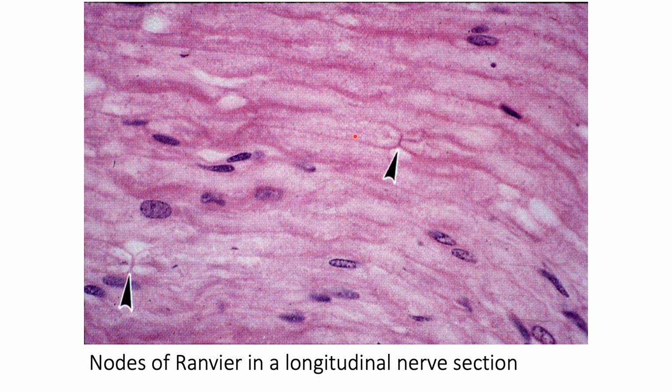Now, what you see here is not showing dendrites and cell bodies. It's rather showing the processes of an axon. Okay, now you can see where the arrow is pointing. There's a constriction and a line in between, indicating the node of Ranvier between one myelinated area and then the other. These are nuclei embedded within the tissue.